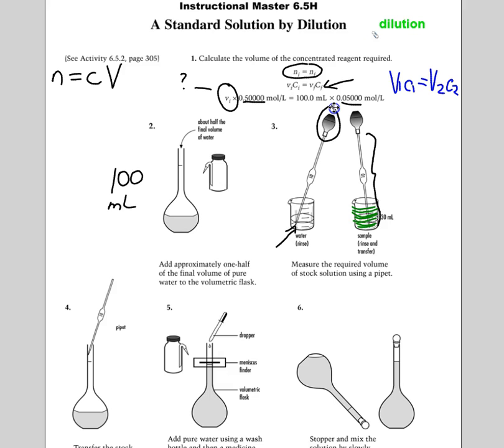I would say a flask is not going to be needed at this point. We could ensure that the pipette is put into the neck of the flask, and then at this point, when you deliver all of this 10 milliliters, we'll say, into the flask, you would want to make sure that all of it is removed. Sometimes what's done is you would cap it at the top with your hand and place your other hand over the middle of the bulb here, just to cause the air inside to expand, and that would force out any little bit of liquid that might have been in the bottom there, which is part of your 10 milliliters. Once that's been done, you're not going to rinse your pipette.